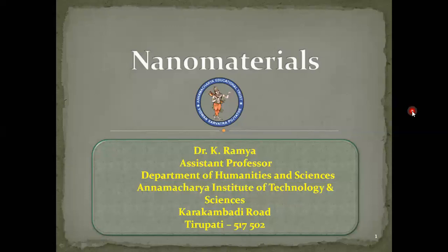The second one is SEM, that is, scanning electron microscope. By using a scanning electron microscope, we are going to see the morphology of our material, how the atoms are allocated in our material, and what the distance between the atoms present in our material is. Whether all the atoms have the same interatomic distance or various interatomic distances, or there is a huge distance between the atoms. And what the grain size is in our sample. All the details are given by the scanning electron microscope.